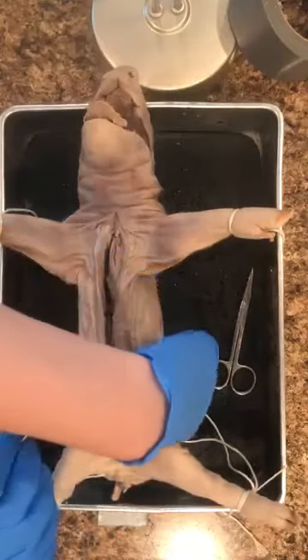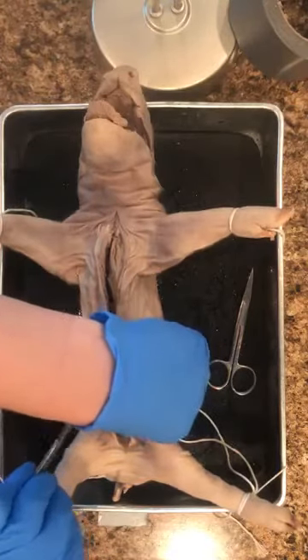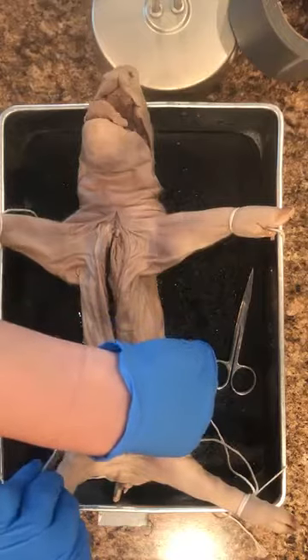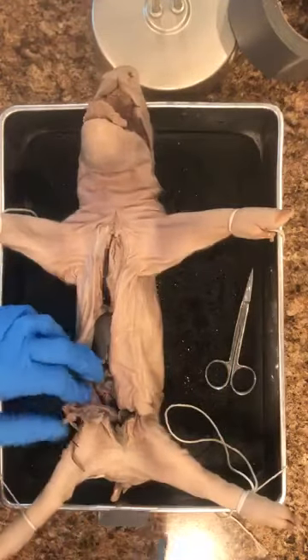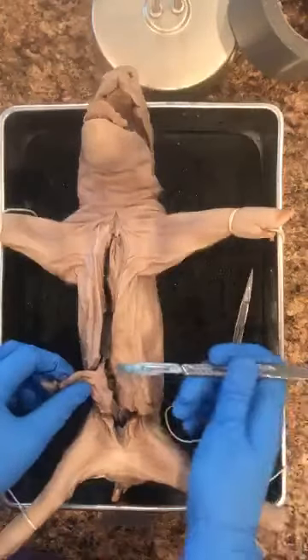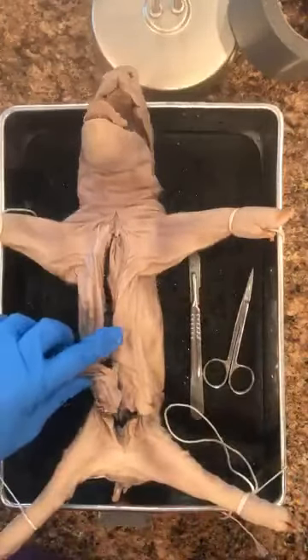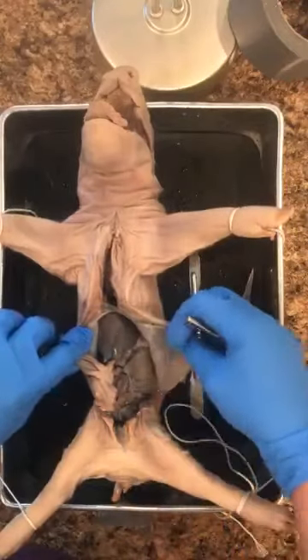Okay, I'm going to cut around the umbilical cord because I want you to be able to see its point of attachment on the inside. Which I already cut. So, okay, right here. Use my probe. So when I open it up, the very first thing that you see is the liver.